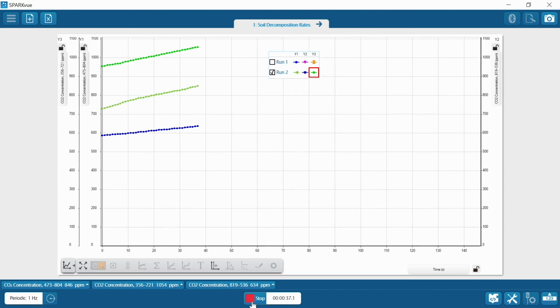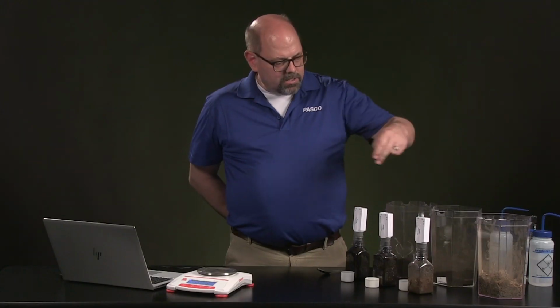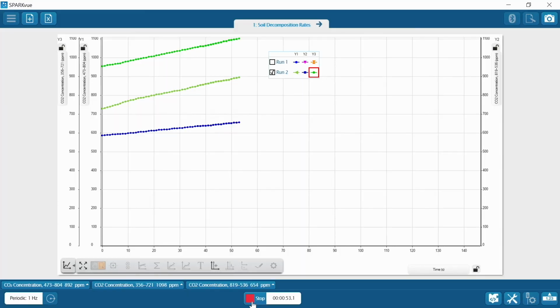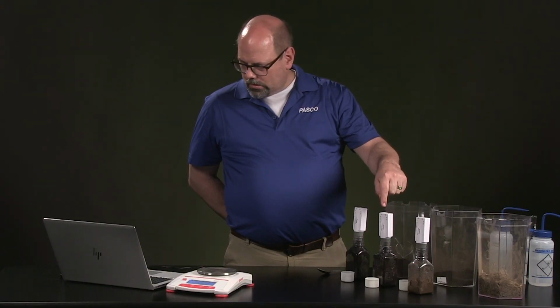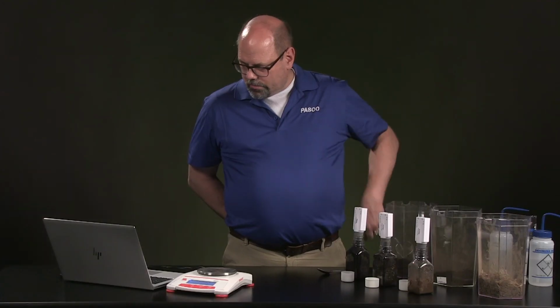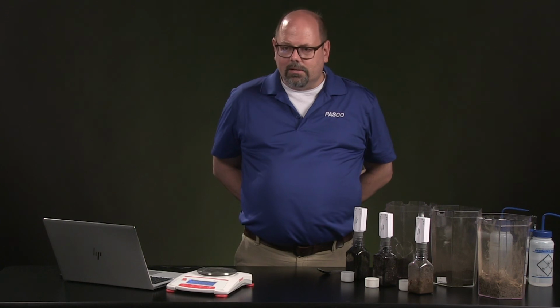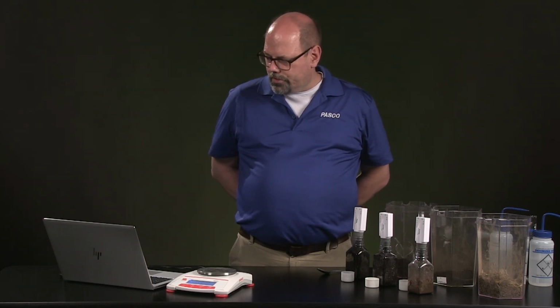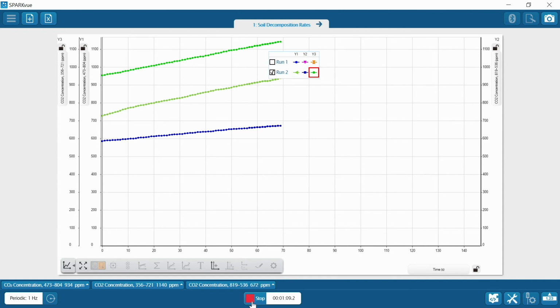Okay, in this example, Y1, the middle green, the more beigeish or khaki green in the middle, is the prairie soils. The blue, Y2, is from the forest soils. And then Y3 is the store-bought soils. Now, don't be confused about the height of those, but it's the rate at which the CO2 is being produced when you're thinking about this data as it's coming out.